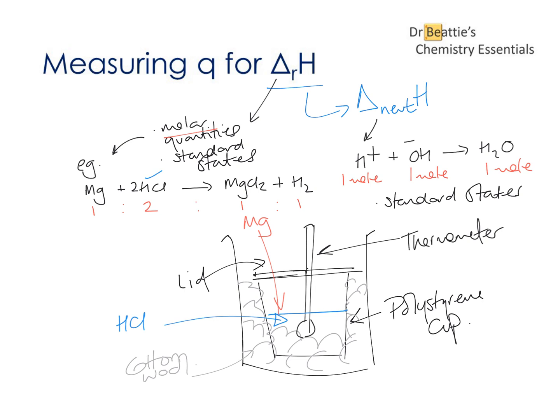In this case, we chose the aqueous solution first because we can get a temperature reading for that, and then added the solid second. But obviously, if you were looking at a neutralisation reaction, both acids and alkalis are in aqueous solution, so you could use one or the other first. It really doesn't matter, as long as you're taking an initial temperature before addition of the second reactant.